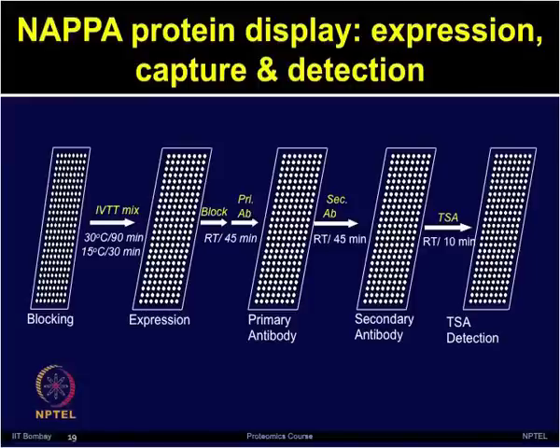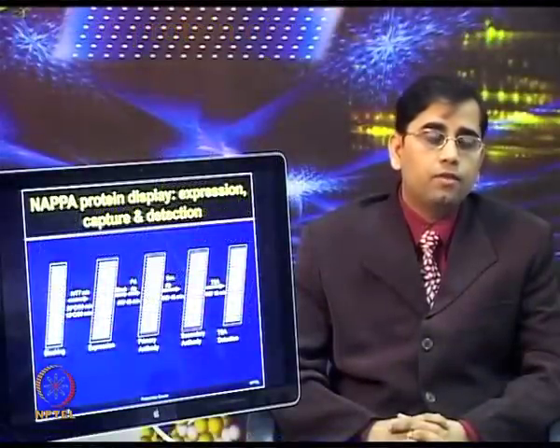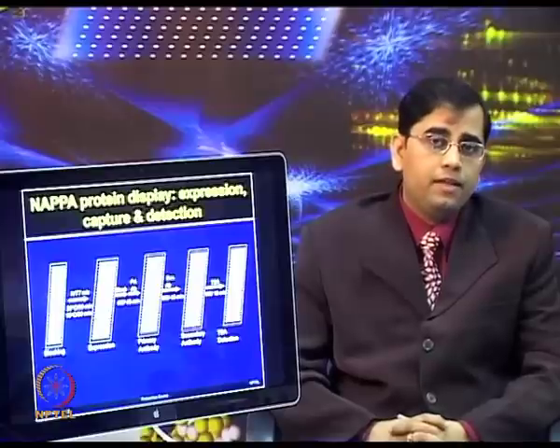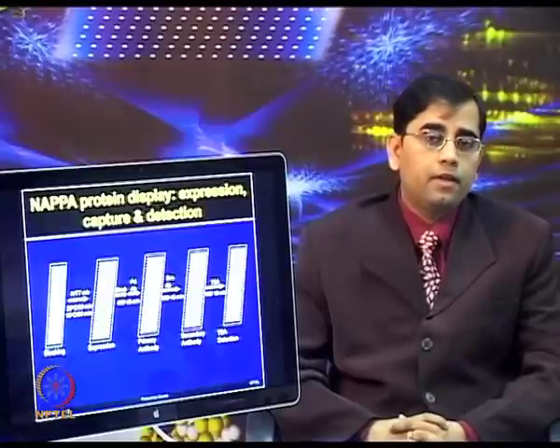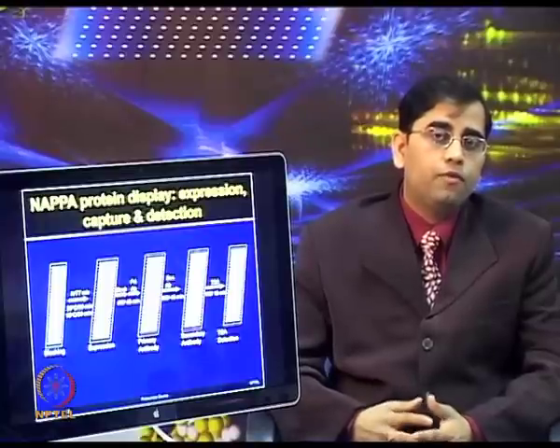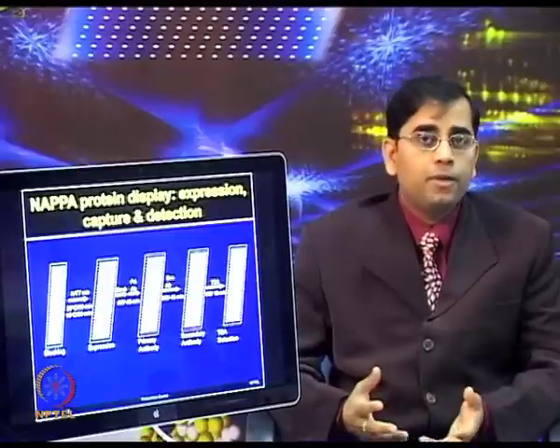After blocking is done, the in vitro transcription and translation mix can be added on this chip surface. Incubation involves two steps: incubation at 30 degrees for 90 minutes, followed by 15 degrees for 30 minutes. It has been observed that lowering the temperature from 30 degrees to 15 degrees helps in protein capture. So, there are two steps involved here.